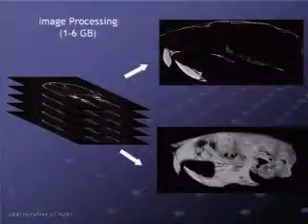Our detector capabilities are probably going to be doubling in the near future, so we will get 2K by 2K resolution. Now we're starting to get quite sizable data sets that are hard to actually manage for normal applications. What we do with those data are various.